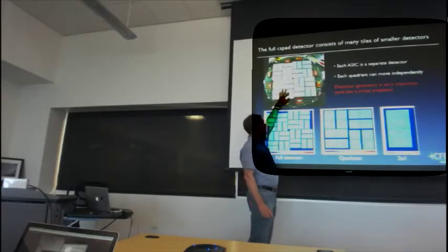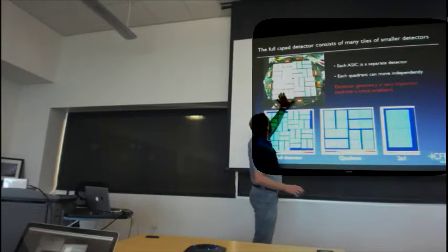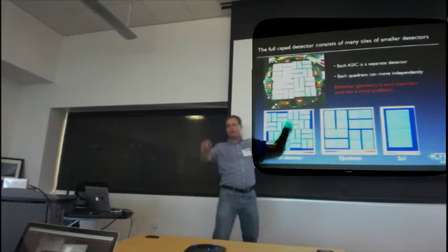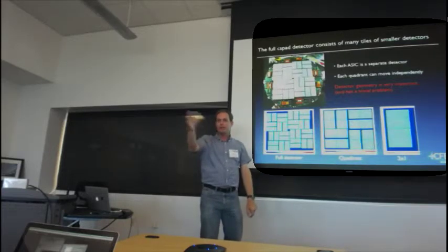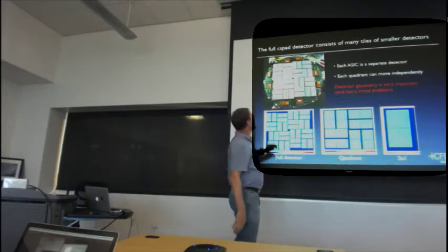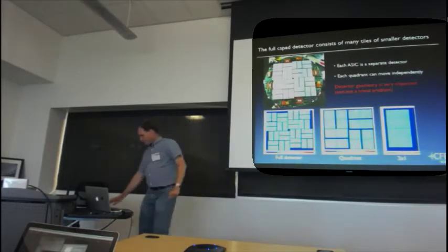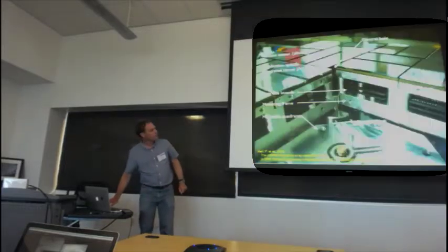But every now and then we kill them. Every now and then they're replaced. These are just put into sockets. And even better, these quadrants here can move. And there's a supervisor knob where you can change the gap and change the detector positions. And this changes the relative location of all of these ASICs. And knowing where those things are in space is pretty important.